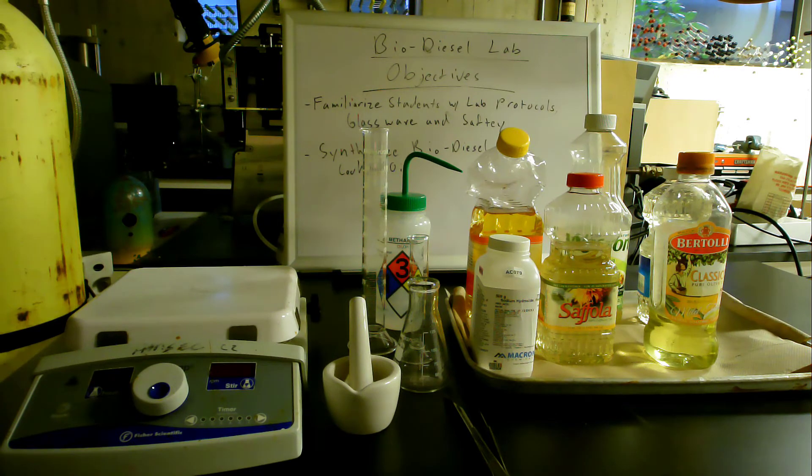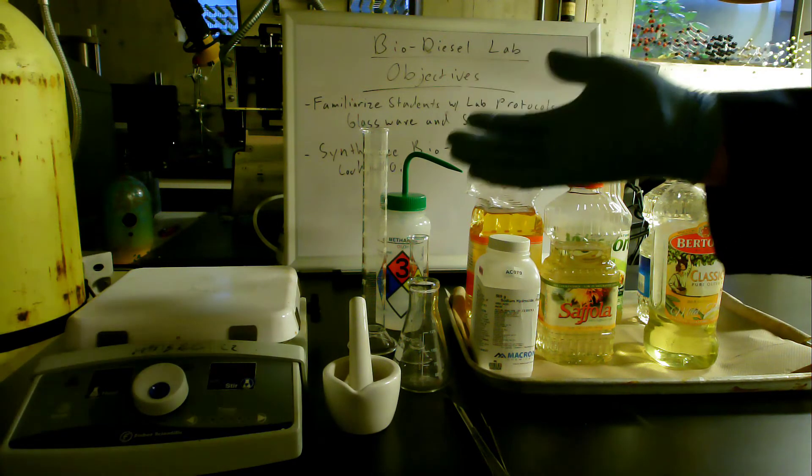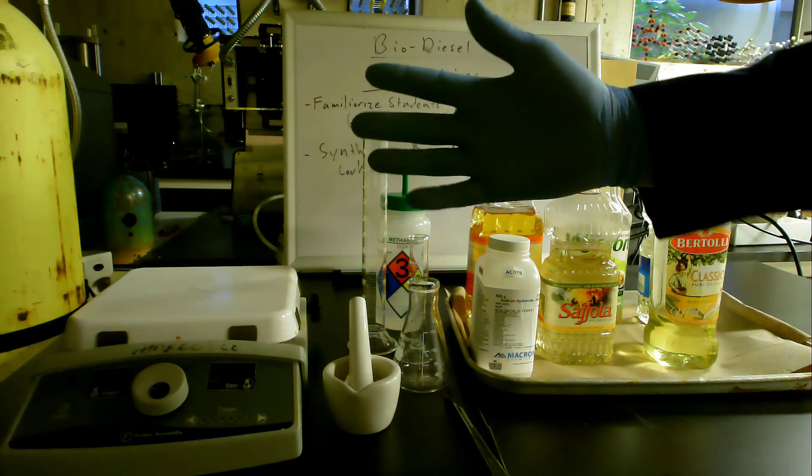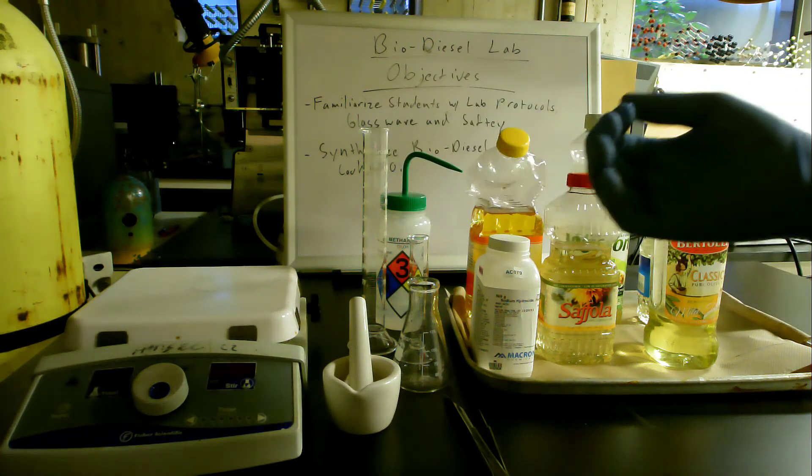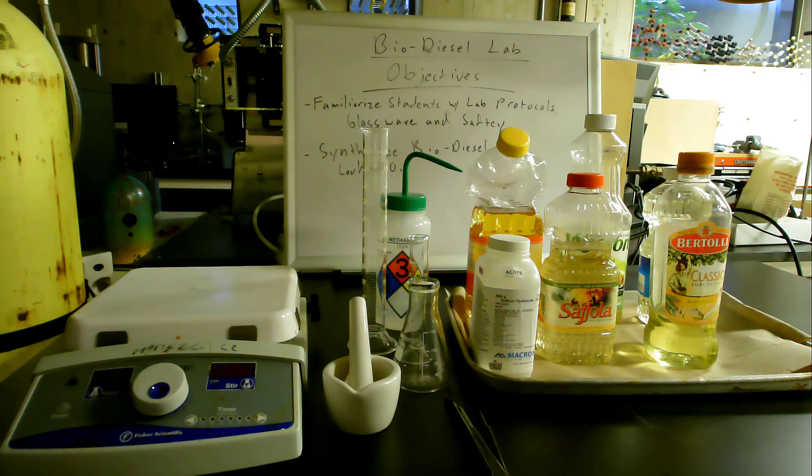As far as safety goes, we typically are going to wear gloves when handling any chemicals. The gloves are to keep the chemicals from touching our skin but you have to be very careful when you use gloves that if you get chemicals on them that you don't then transfer those chemicals throughout the lab especially to another person. So if we use gloves to handle chemicals when we're done we want to take off the gloves.